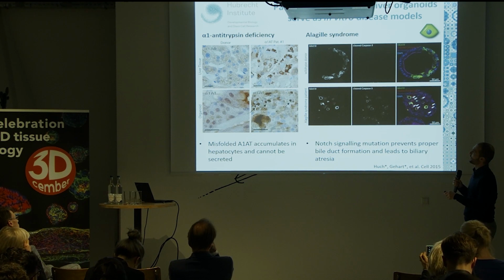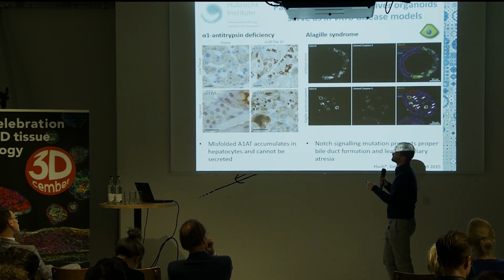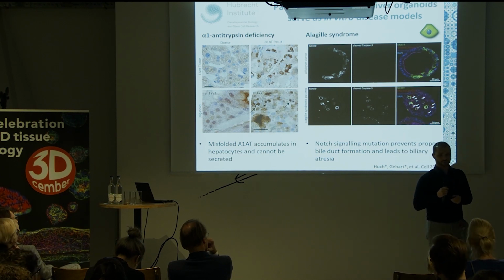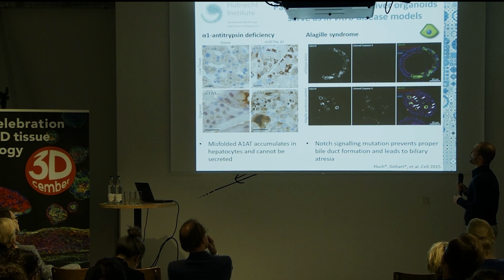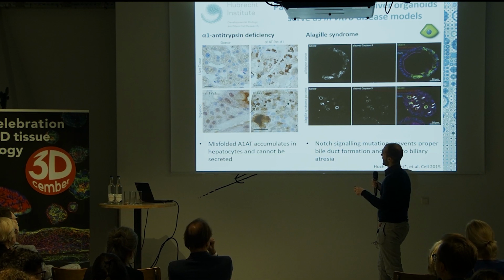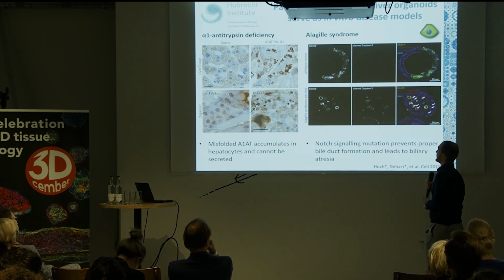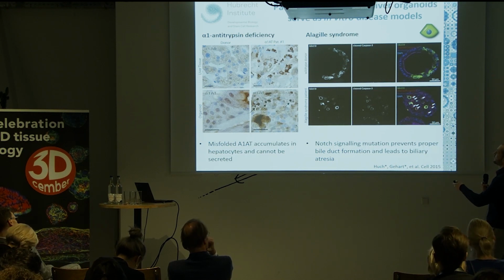This mutation causes the protein to aggregate. It is produced in hepatocytes. So indeed, in the tissue, you see these large aggregates. And since alpha-1 antitrypsin is a neutrophil elastase inhibitor, and it cannot be secreted, these patients suffer from a wide array of different issues that is essentially caused by an overactivity of elastase that is digesting their own tissues. If you now isolate organoids from either of those, we don't see any aggregates in the organoid of the healthy donor, but we can find the same aggregates in the differentiated organoids of the patient. This is differentiation to the hepatocyte fate, since hepatocytes are the main producer of this protein.